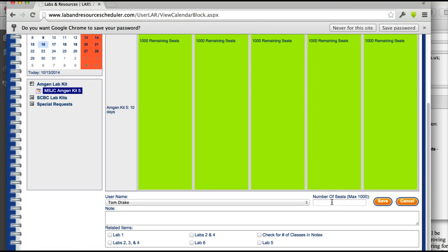So I've clicked all 5 days in this week of December, and now I'm going to enter some of the information that's needed below. It's very important to put in the number of seats. So for my classes at MSJC, we have 32 seats, 32 students usually. And we also need you to put in a couple of notes. So make sure you indicate how many classes you have. So I have one class with 32 students.